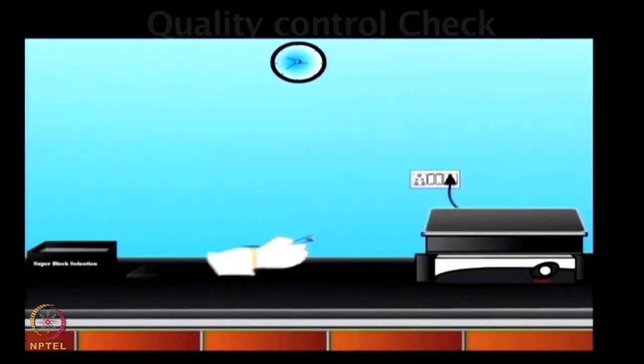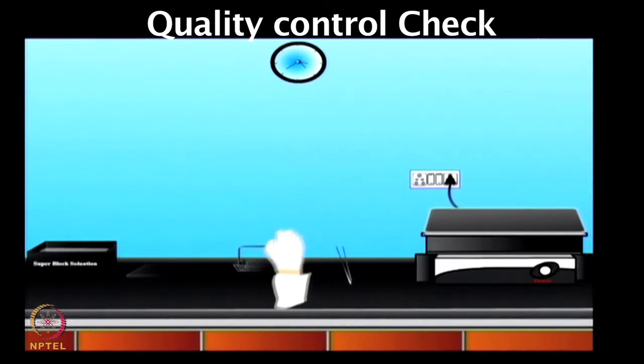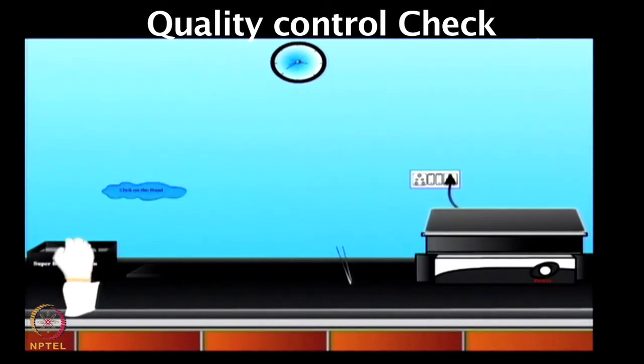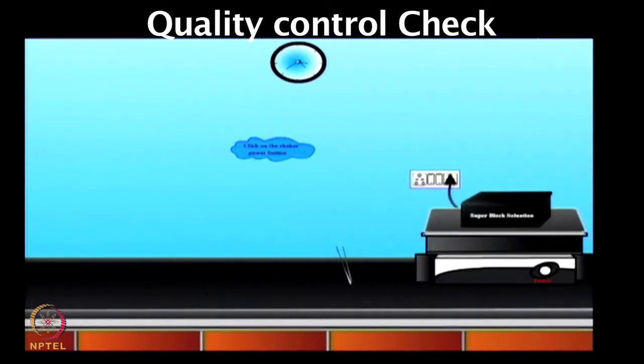Let me show you this animation for quality control checks and how to detect DNA and protein expression on this chip surface. Once the arrays are printed, then we need to perform the quality control checks whether DNA printing was appropriate on these chips. The storage form of NAPPA microarrays is merely DNA. So, in an activated array, all following reactions elapse in the solution and in the real time. Therefore, restrictions caused by the instability of proteins occur very rarely.